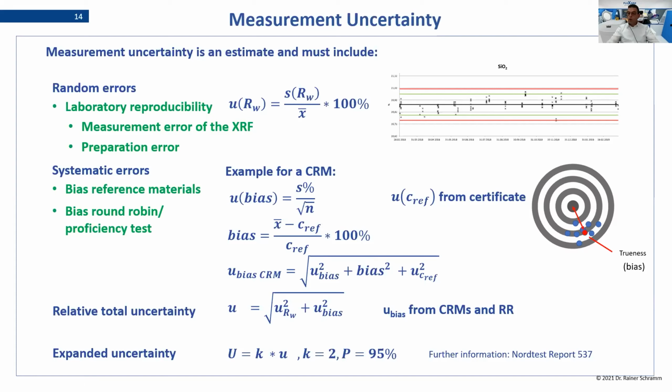What parameters should one look at when validating a calibration curve? So for the validation of a calibration, I would say that you have to cover the concentration range of the calibration. And if your samples cover different matrices, you also should select different check samples with different matrices. And of course, all these samples should not be part of the calibration. They should be really independent.